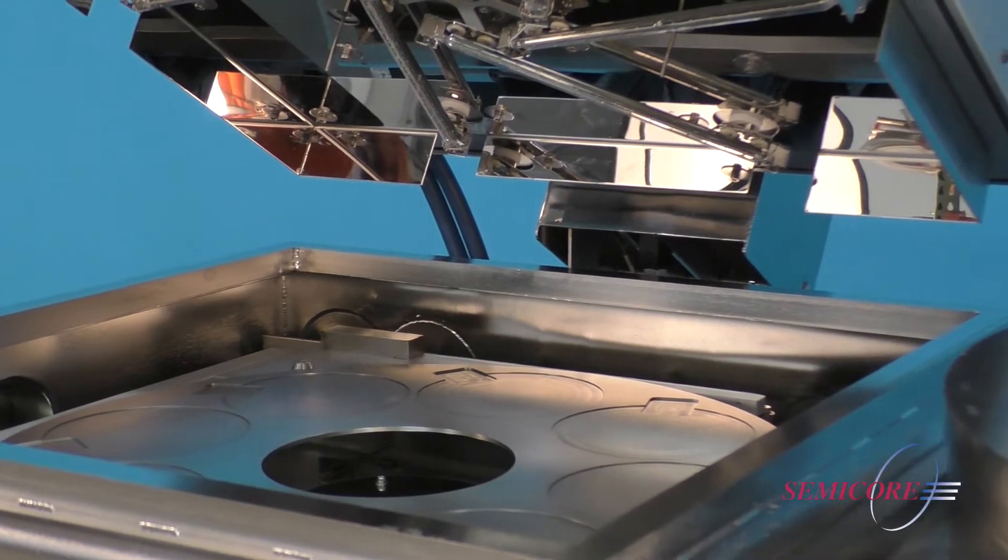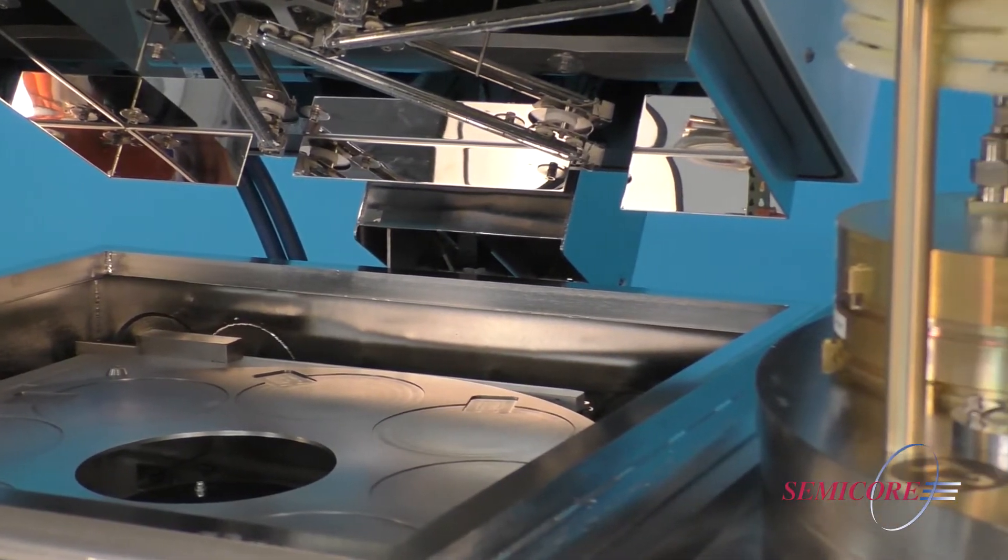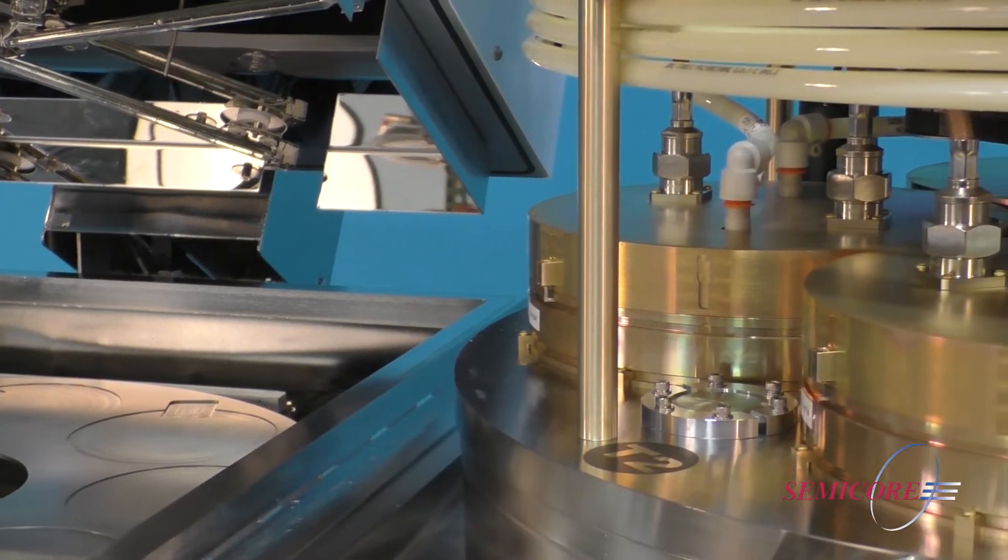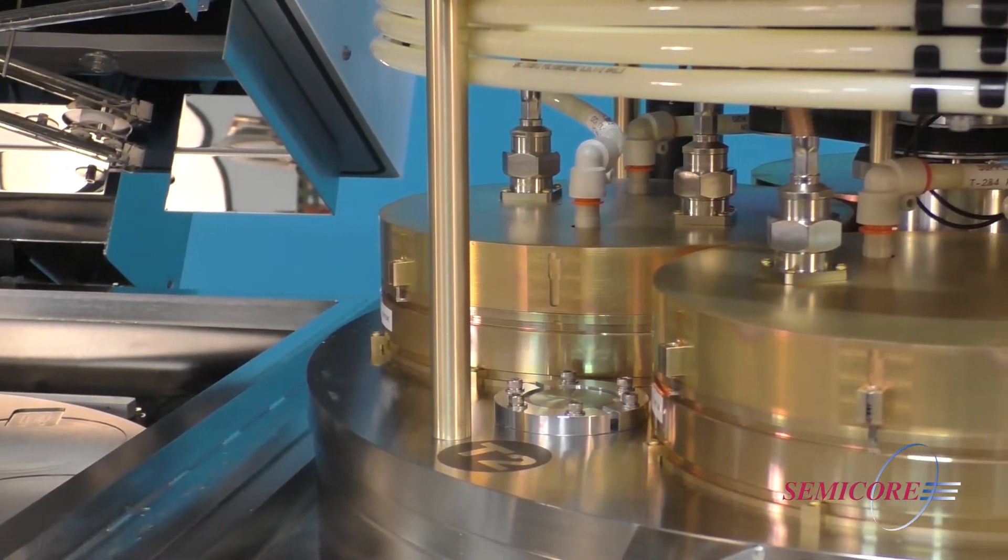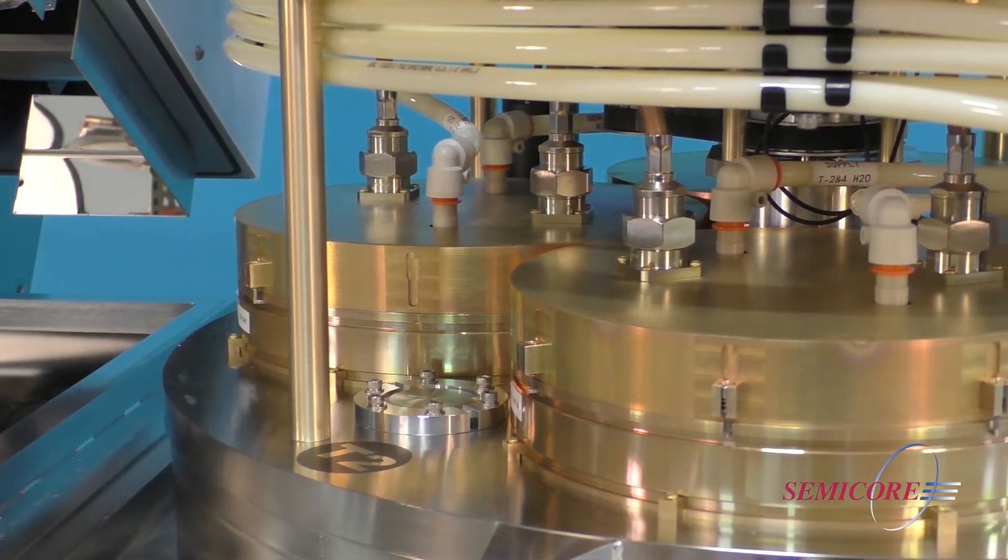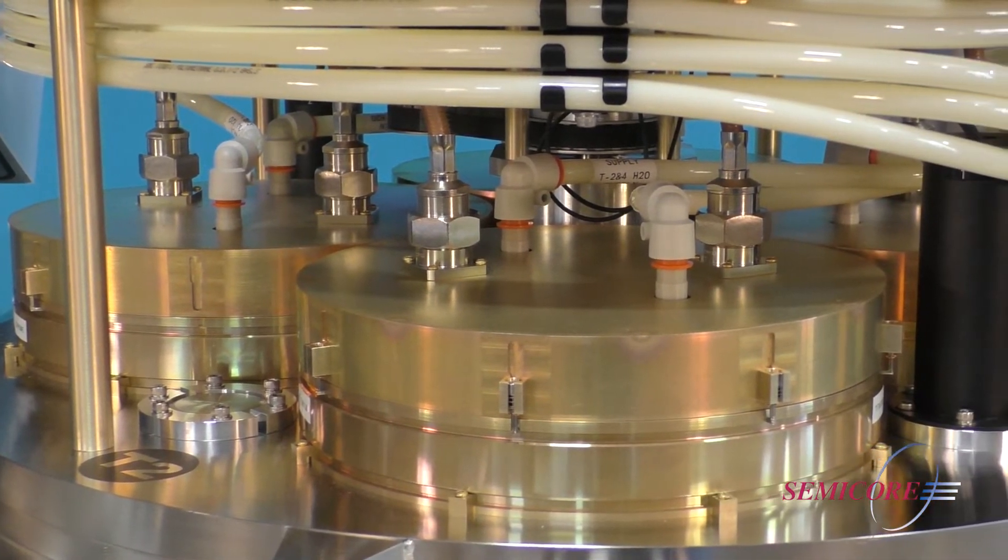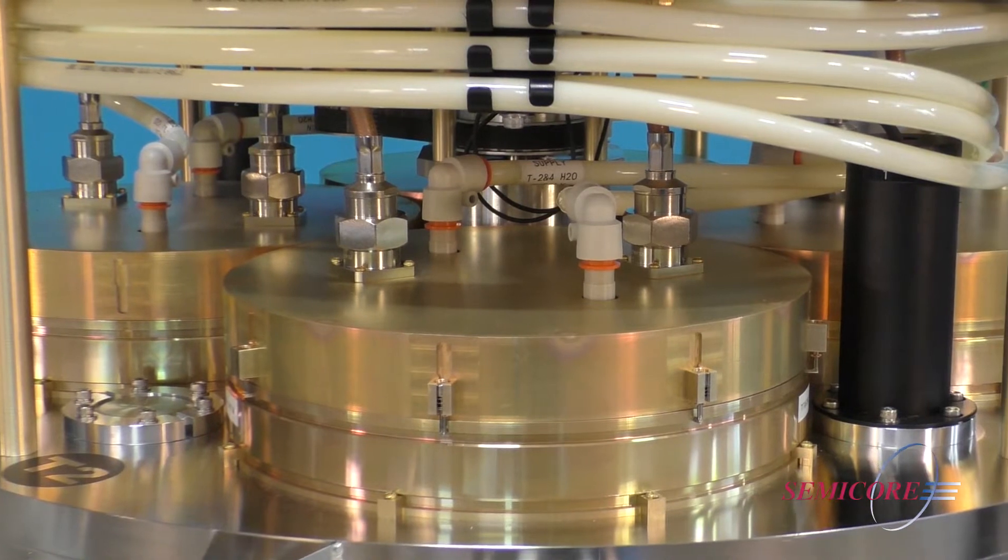The Perkinelmer 4400 series is a dual-chamber, fast-cycle load lock system that utilizes up to four water-cooled cathodes, which can be configured for RF or DC magnetron, RF diode, reactive sputtering, as well as co-sputtering.